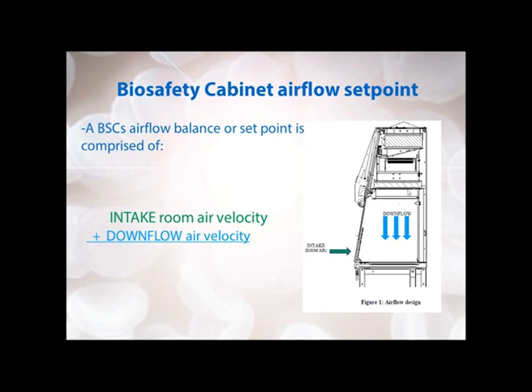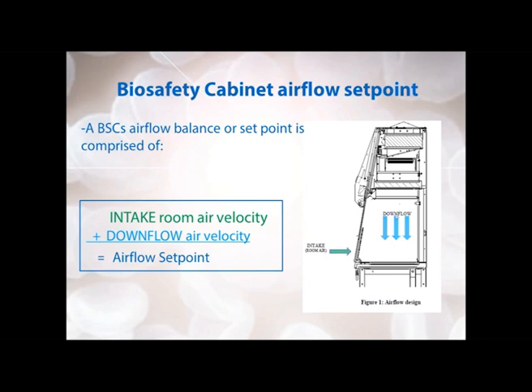This is then balanced with the amount of downflow air coming down through the HEPA filter, shown here, and through the diffuser, down into the work area. So you have two sources of air — one through the intake and one through the downflow. These two values or speeds of air make up the airflow set point.